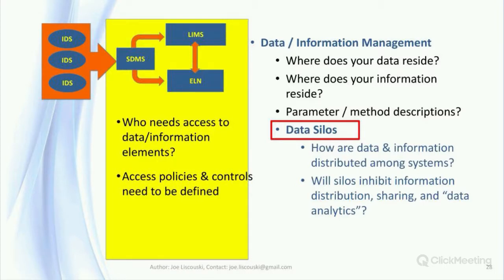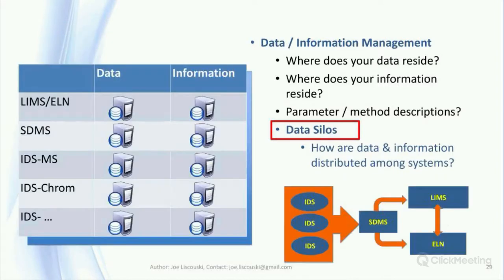Note that data analytics, a common phrase, is in quotes, as it refers to a class of informatics analysis rather than instrument output. Given the discussion earlier, labs don't want to distribute instrument data, but rather the information resulting from lab work. The reason for the problem's existence is a lack of effective planning. The potential use of lab work needs to be thought through as part of a laboratory informatics architecture.